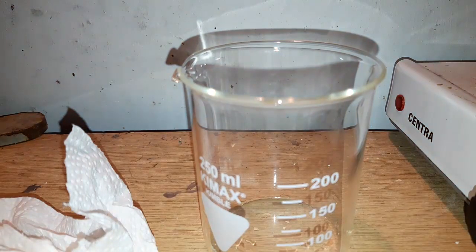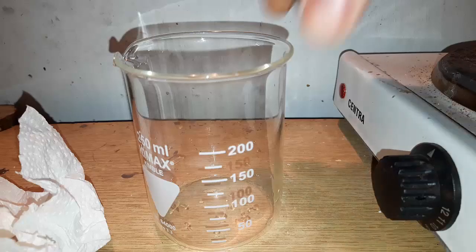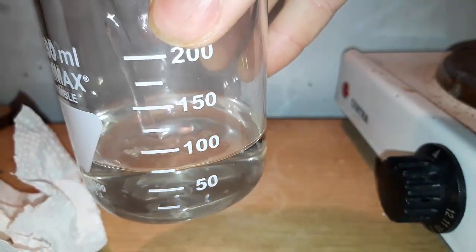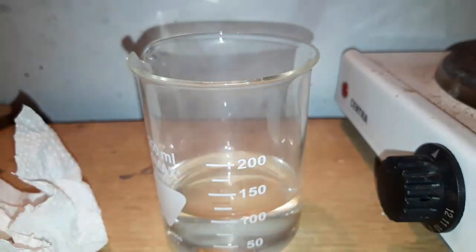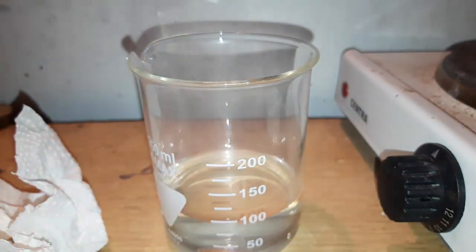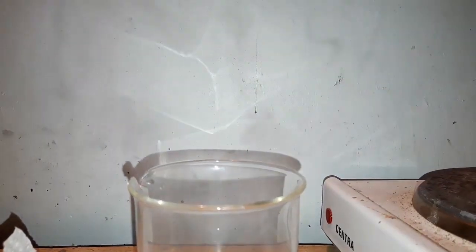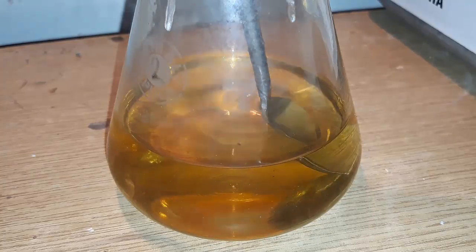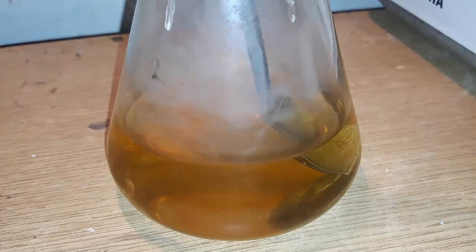We measure out 100 milliliters of 30% hydrochloric acid. We can see it fuming since it's so concentrated. We add the HCl to our flask in small portions — adding about 20 milliliters at a time is a pretty safe bet.